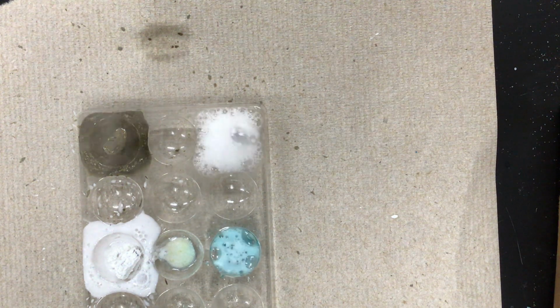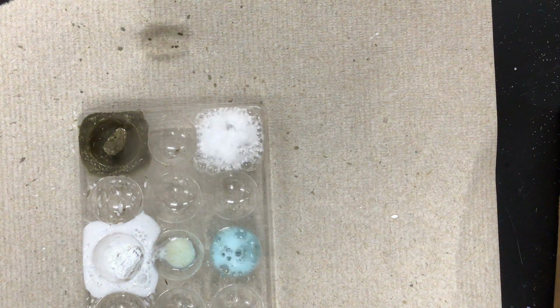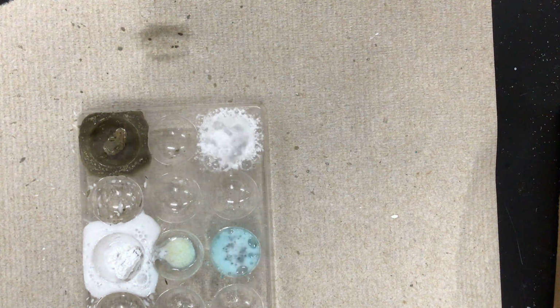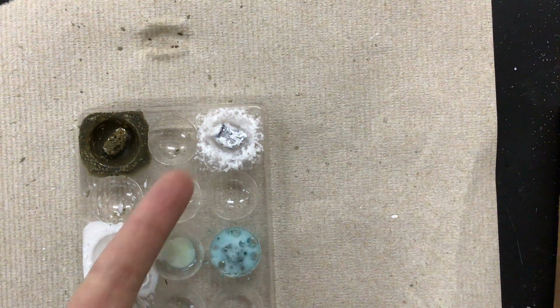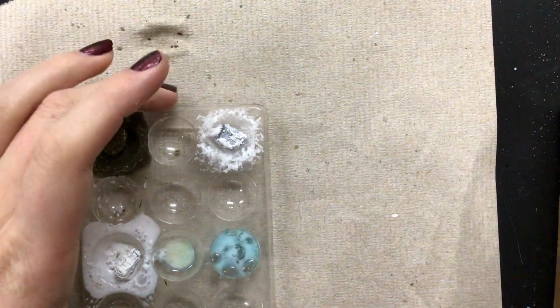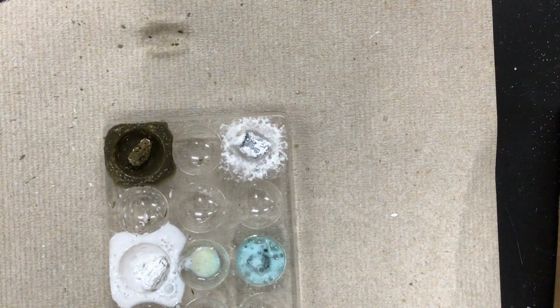You can hear this one. There's a lot of little explosions. There's a lot of gas that's being produced. You can kind of see the smoke coming off of it. Ooh, that one is a very fast reaction. So you can see the copper one is still reacting, but the hydrochloric acid has already been used up. So that was a very violent, very fast reaction. And I bet, yep, that one was also very hot on the bottom. So that one was also very exothermic.